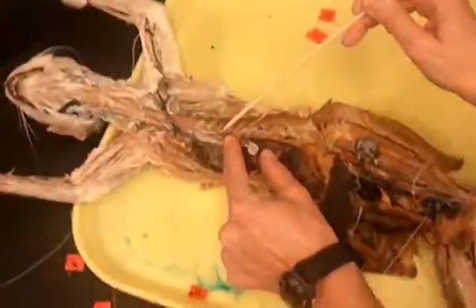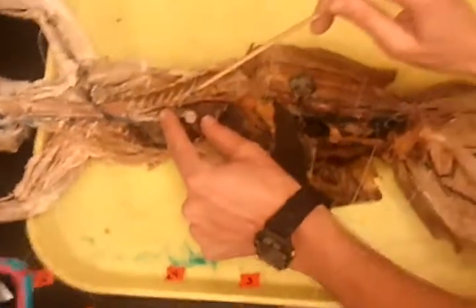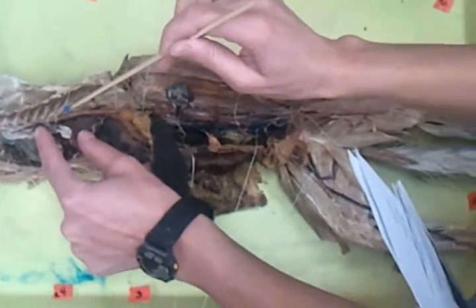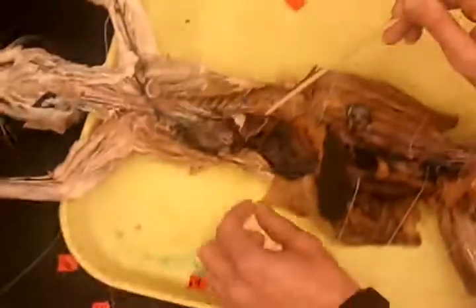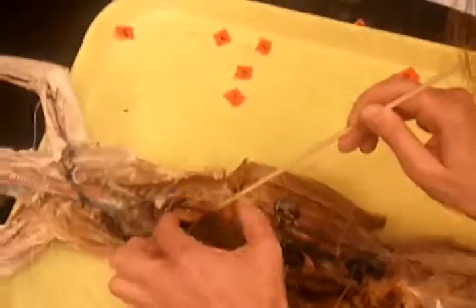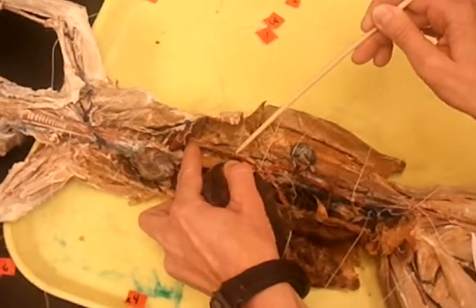Okay, so I'm just going to reflect back. This is what's left of the little lung tissue. But here you can make out the descending aorta. And the blue pin is stuck into part of the descending aorta. That's labeled as number 1 on your list. Yeah, because I couldn't get the string around it. This is still descending aorta.